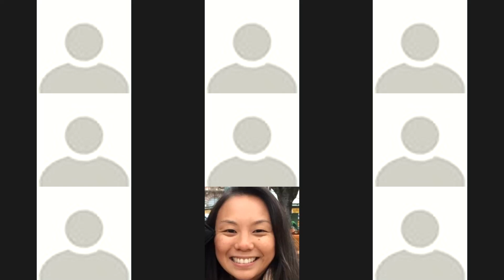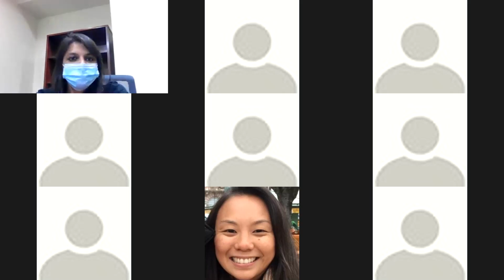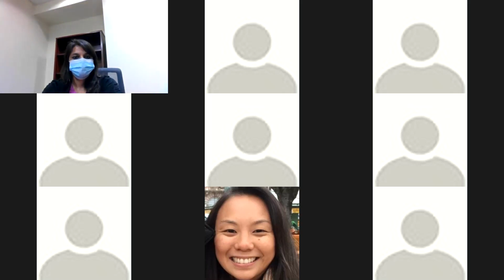How are you? Okay, so I have maybe a silly question. I'm not familiar at all with imaging, but I had to use ImageJ for some quantification for blots. When you talked about the ROI, can you also save a spot, like a circle, if you draw a circle? Then you can save that, and then move it around across the rows. Is that possible?